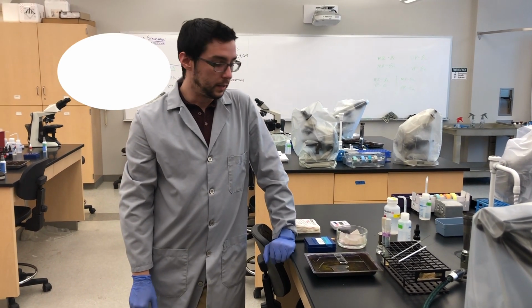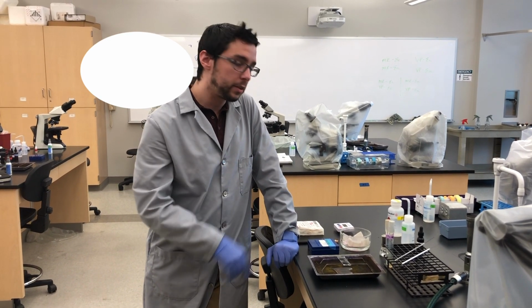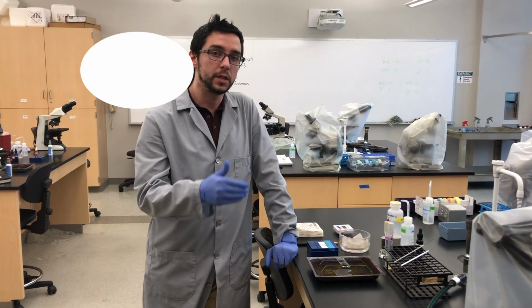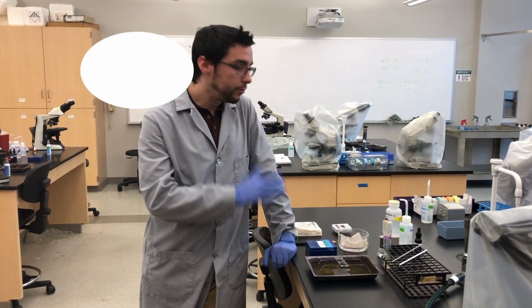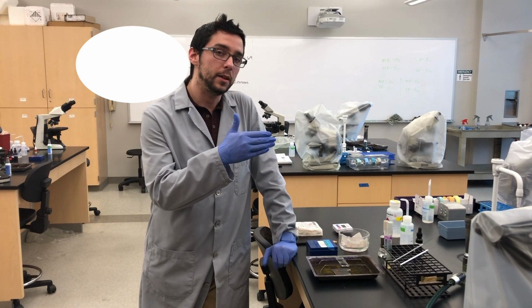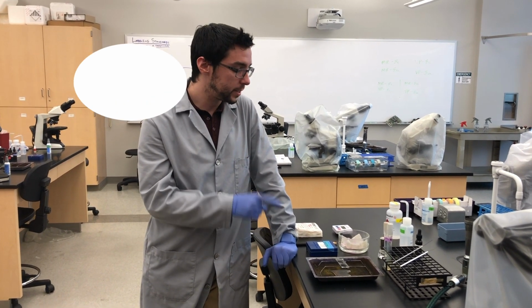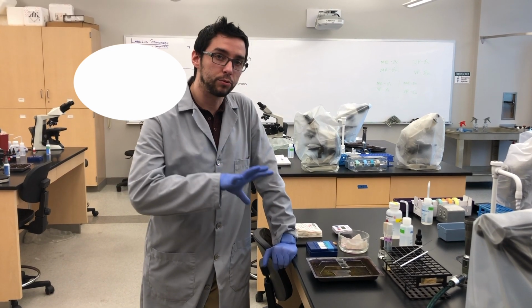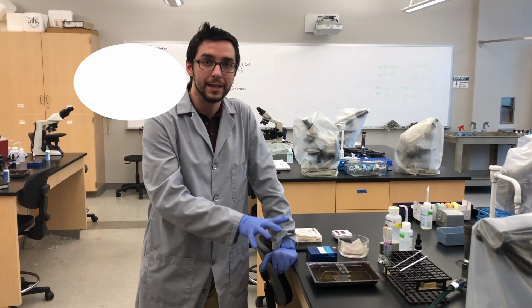Okay? Now, with this, what is the methylene blue doing? This is your counterstain. This is your second stain that you're coming in with. If everything went according to plan and you have a positive acid-fast cell, what you're going to notice is that red soaked in through the mycolic acid when we heated it up and got trapped underneath it.